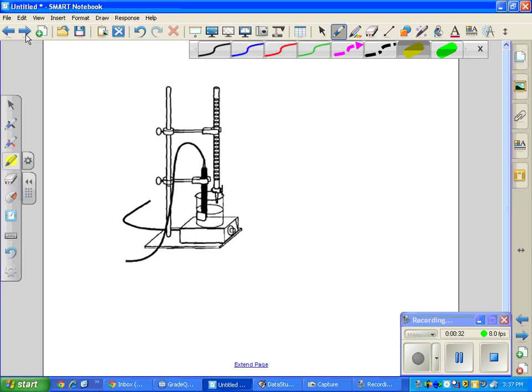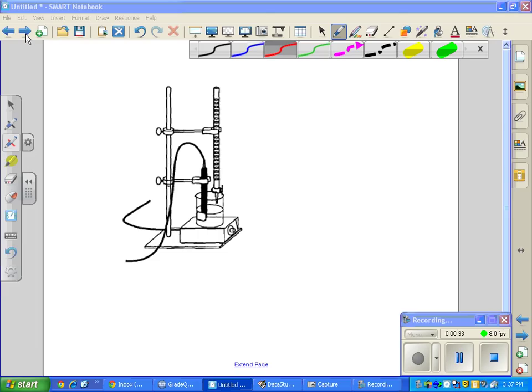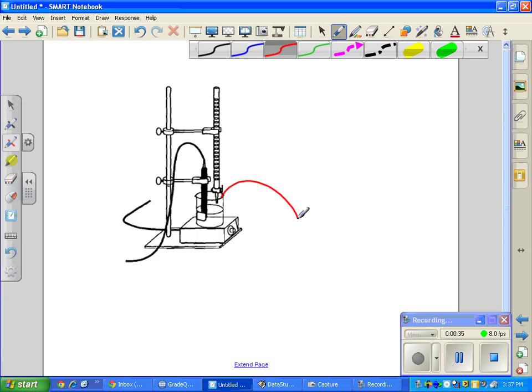Your setup for the lab is going to look like this. A couple key things to review: the acid you're going to measure out is going to go in a beaker on the bottom — 25 milliliters of a weak acid. It's actually going to be acetic acid, HC₂H₃O₂. 25 milliliters of the acid goes in the beaker.